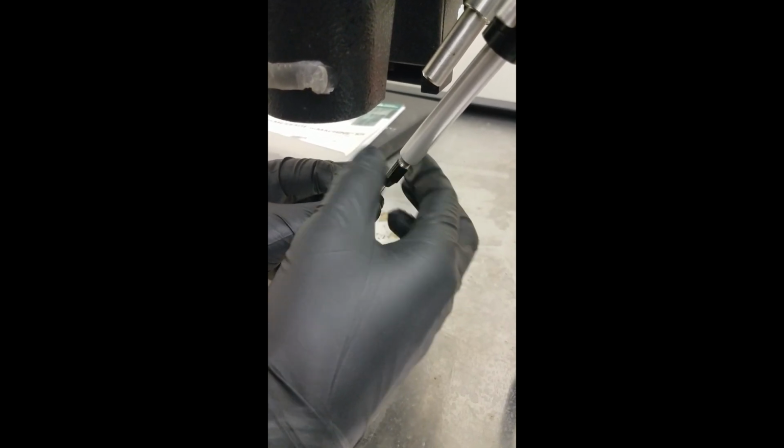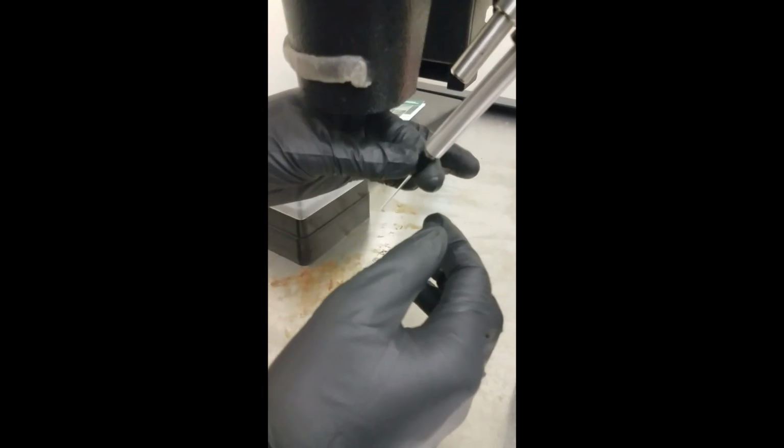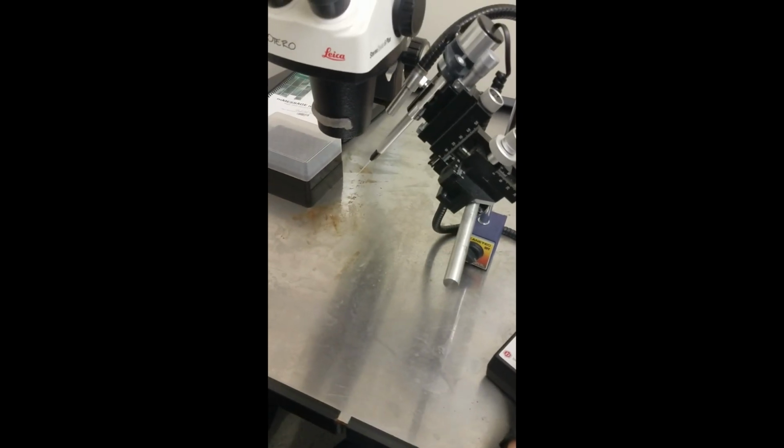Then the last step that you need to do to prepare the needle before injections is to empty it. So if you come over here to the control panel, you just push and hold empty until it beeps at you again and the plunger is completely into the glass tube.